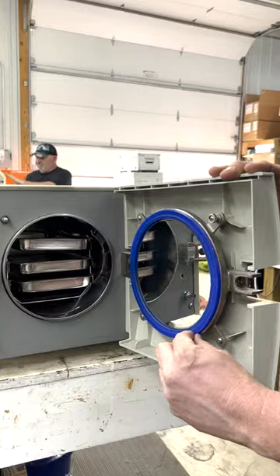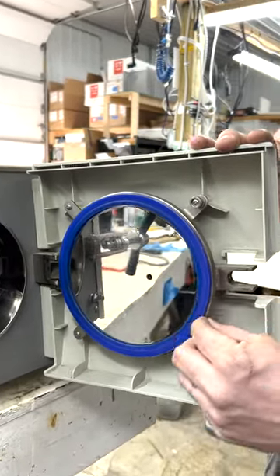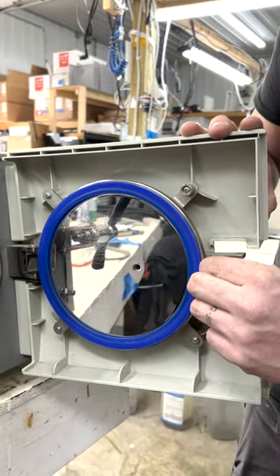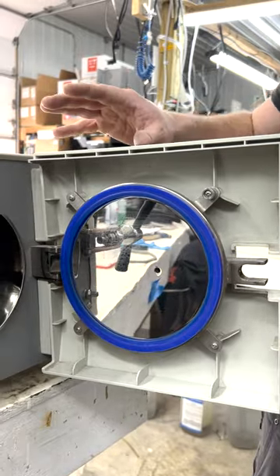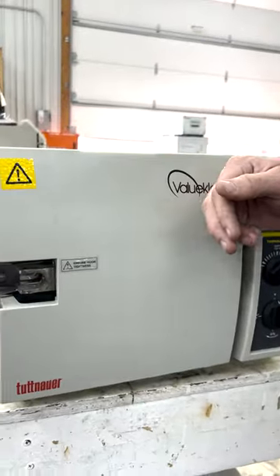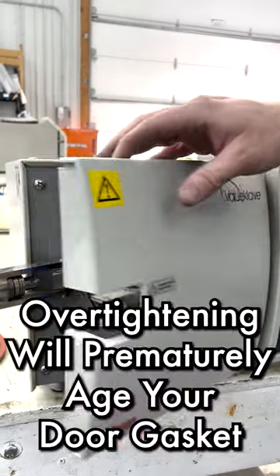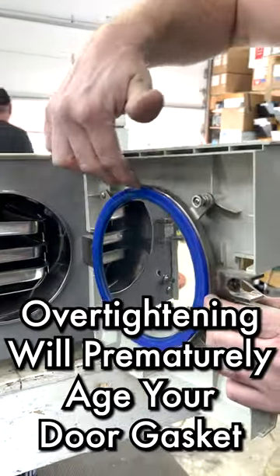This has an OEM door gasket. As you notice, this is starting to get a ring all the way around. If you leave your door closed in a tight position when you're not using the autoclave, it will prematurely age your gasket.